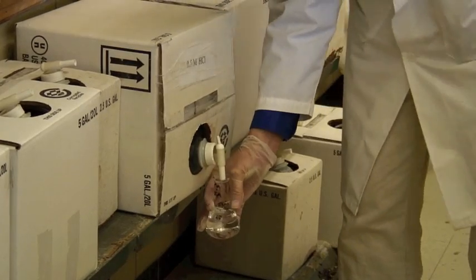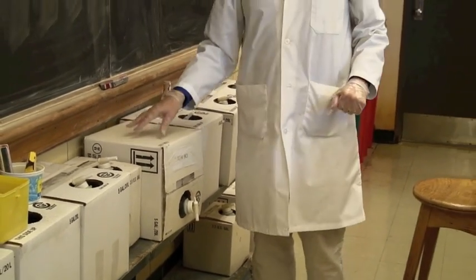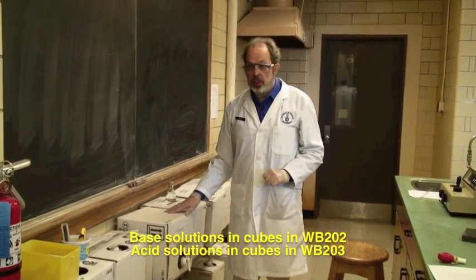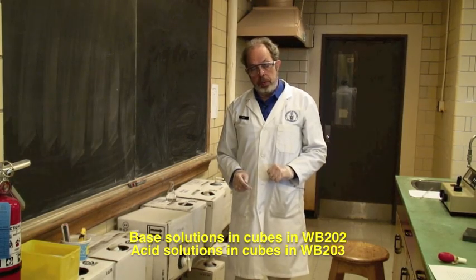Make sure that you turn the tap off so that we don't have dribbling happening. Acids are found in this room, 203. If you need bases, and you will need base for your titration, you'll find that in a cube container next door in Wahlberg 202.